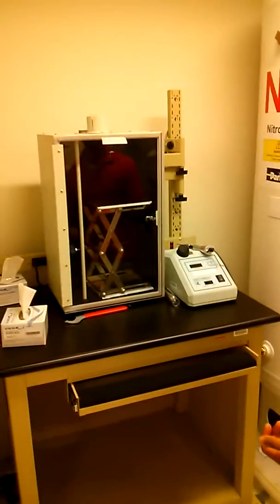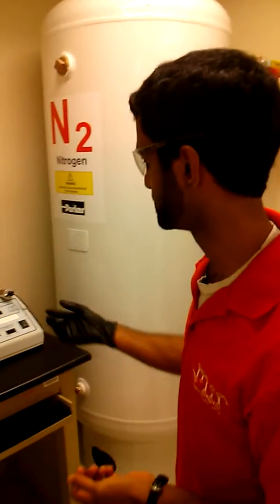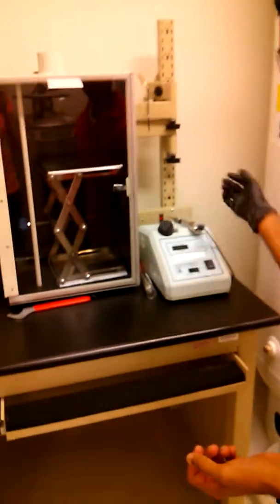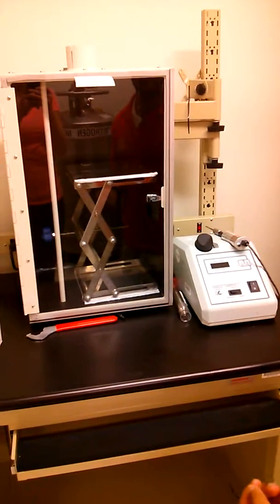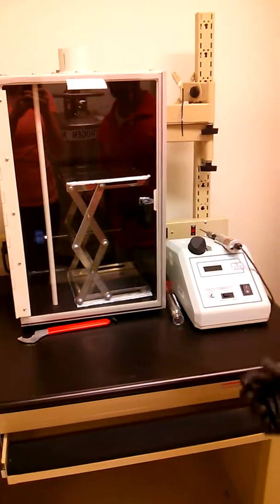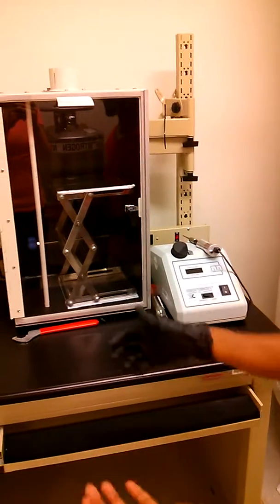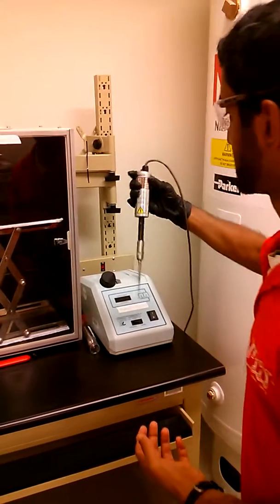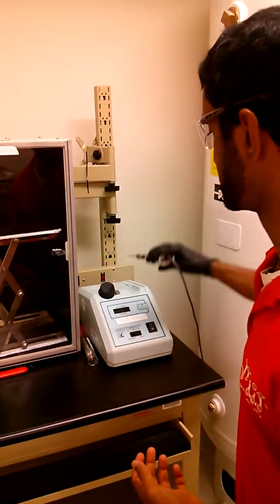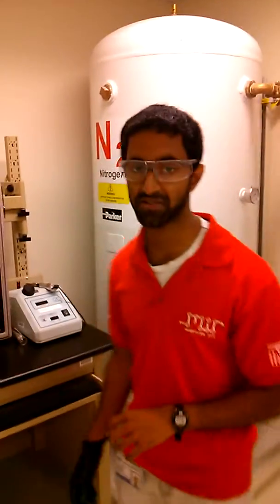Finally, if you're doing work in vitro and you need to lyse your cells, you can use the sonicator here. The sonicator uses ultrasonic waves to just break open cells. And you'll want to do this procedure along with a lot of other things that are done in vitro using ice. So you might bring an ice bucket, fill it up with ice from the other room, and then dip the sonicator probe into your cells and break them open. So that's basically all of the ancillary rooms associated with the Prather Lab.